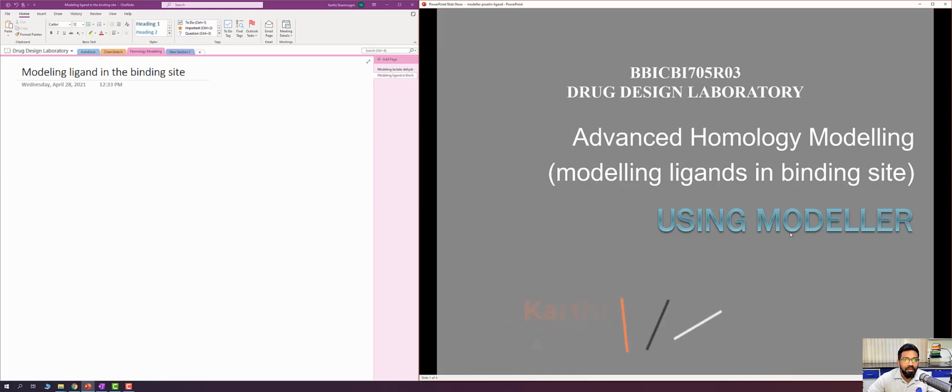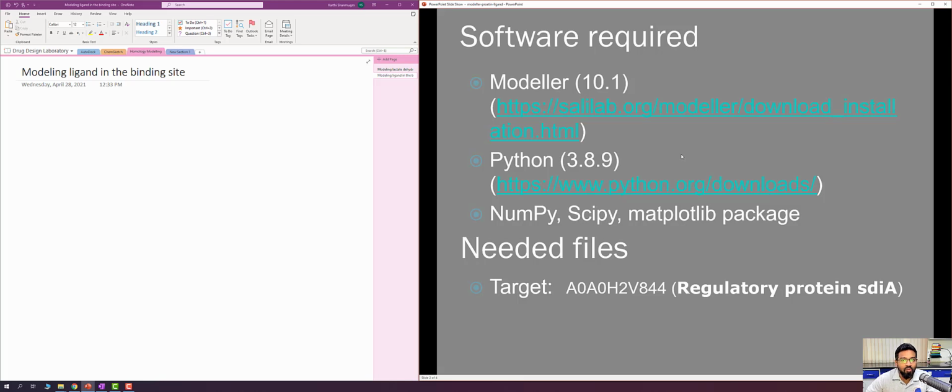Hello everyone, I'd like to welcome all of you to another video tutorial session for the drug designing laboratory course, and in this session I am going to demonstrate how to use Modeler for advanced homology modeling. Specifically, I am going to demonstrate how to use Modeler for modeling ligands in the binding site of the protein molecule. So these are the software packages which are required.